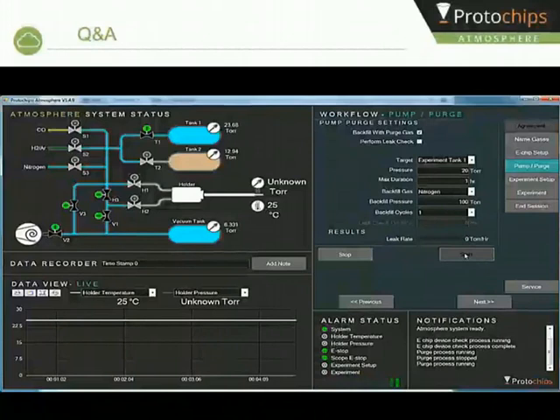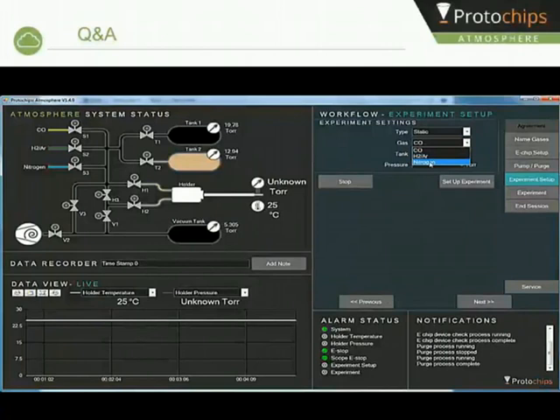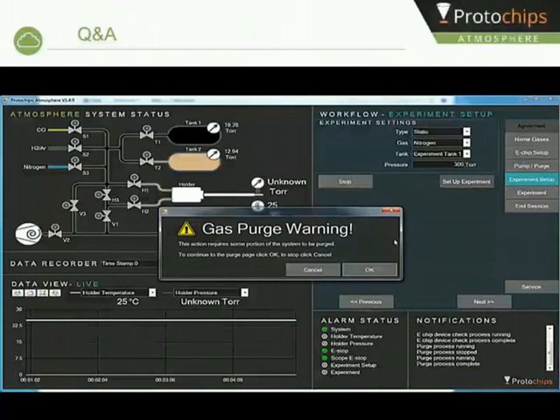Well, when you're using high-angle annular dark field imaging, of course you rely on contrast due to atomic number. So just carbon by itself is not going to give you a great deal of contrast, but any metals on the carbon will show up really clearly. And there's really no fundamental limitation on using oxides. One could study oxides just as well as any other catalyst. Larry, maybe you want to say something? No, you covered exactly what I would say.